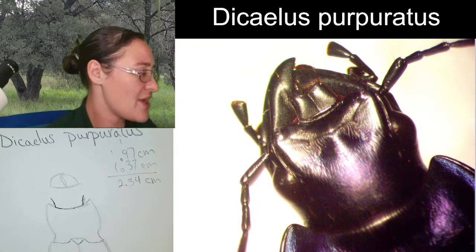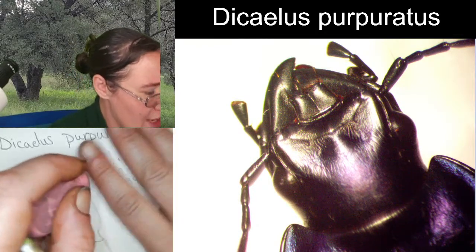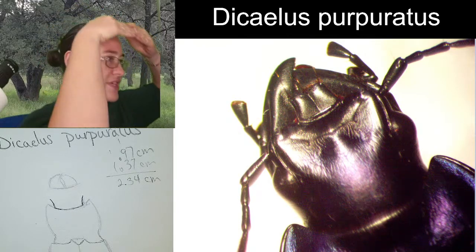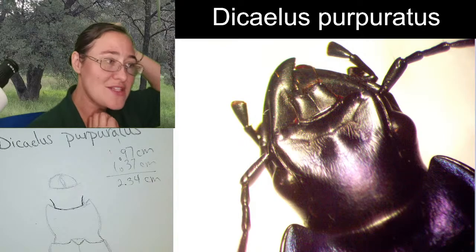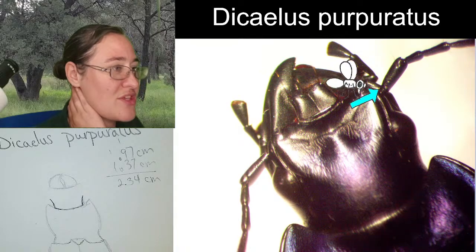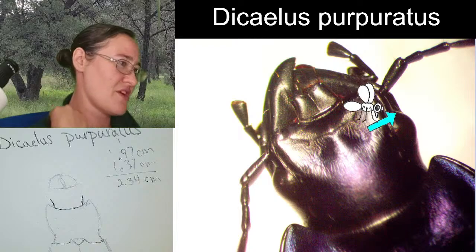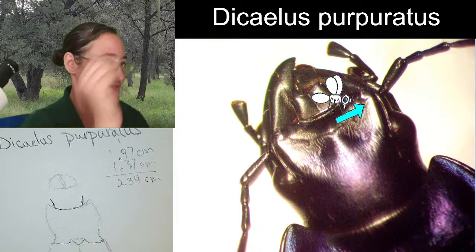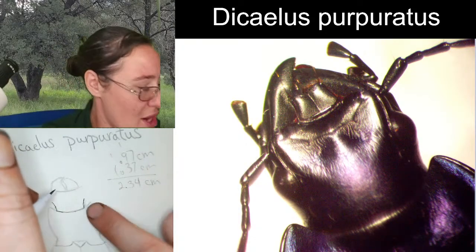Those compound eyes are on the lateral of the head. We're looking at it from the top, but you can see that there's this kind of shelf on the top of its head, and the compound eyes are off to the side. And that's why over here on the right, you can see there's this little bit of the head, kind of underneath and in front of the eye. That's just the bottom part of the head that you can see past it. To give you a little bit of a description there.